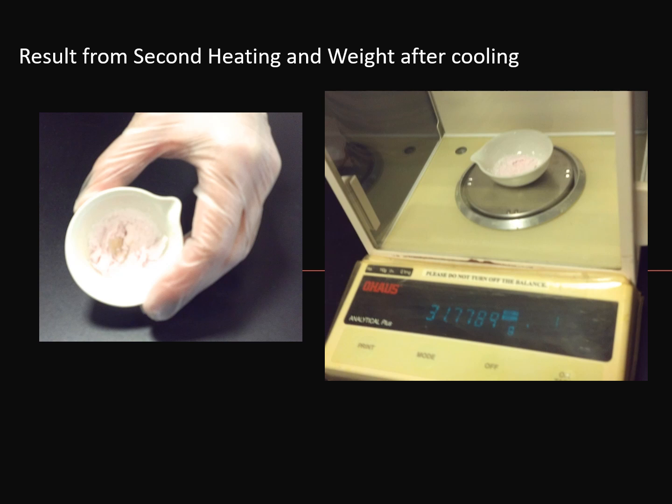Basically, you go ahead, put this back in the desiccator, let it cool, get down to room temperature. So to be consistent between heatings, we probably let it cool in the desiccator around 15 minutes. Once it's cooled, we go ahead and weigh it again. And here you can see what the weight is for our second heating. And then we've finished, because if you can see this amount, the difference is within a milligram. So we're going to stop here.